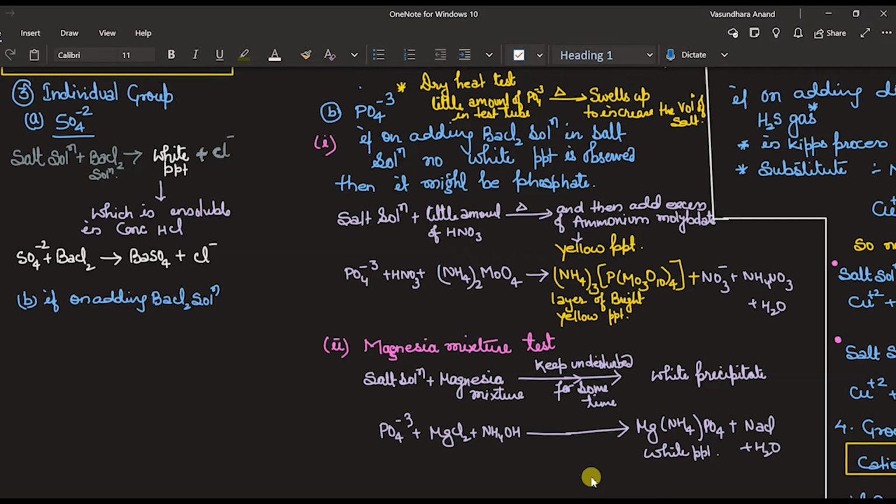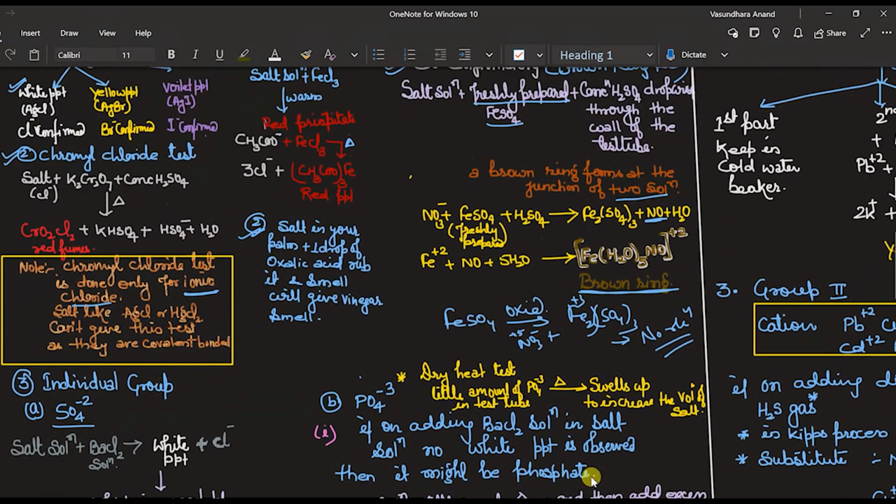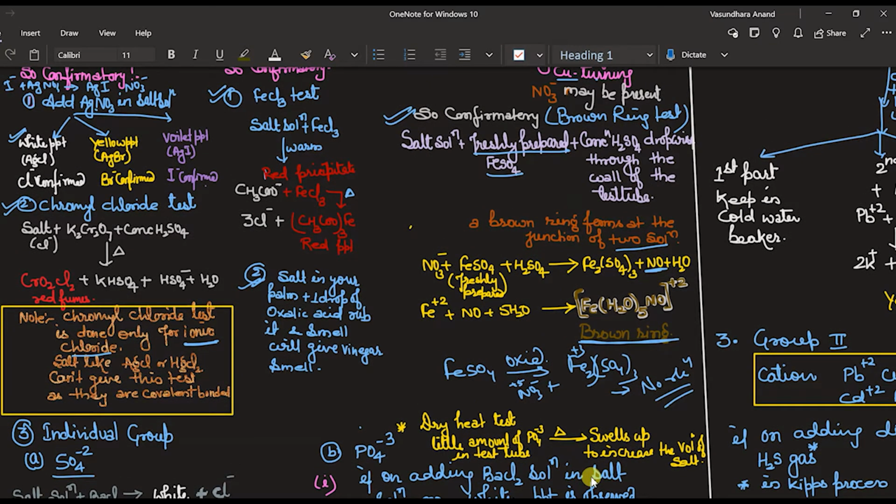So, this is the continuation of salt analysis. One video on salt analysis I have already given to you, in which we have done up to nitrate, that means the brown ring test and how we can identify nitrate, which I told you in the previous lecture. Today we will do the individual groups, that means sulfate and phosphate, after nitrate.